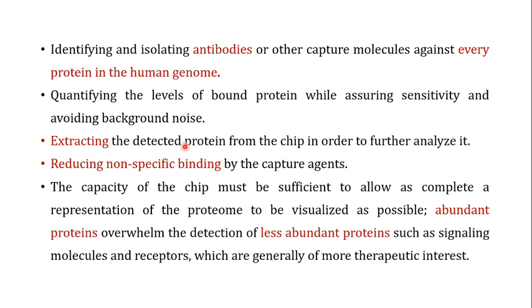So one of the challenges is to make such a protein array so that you can extract the detected proteins from the chip in order to analyze them further, or use them in some other kind of experiments. Currently you cannot do this.